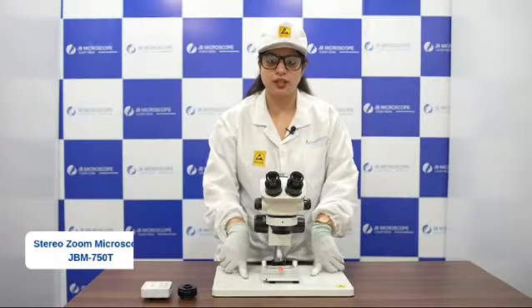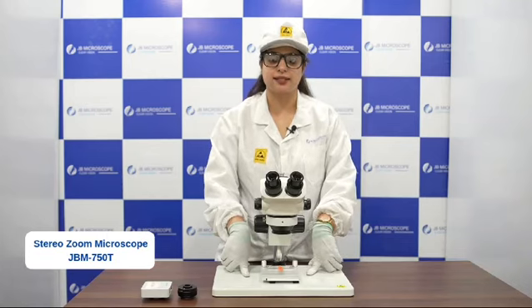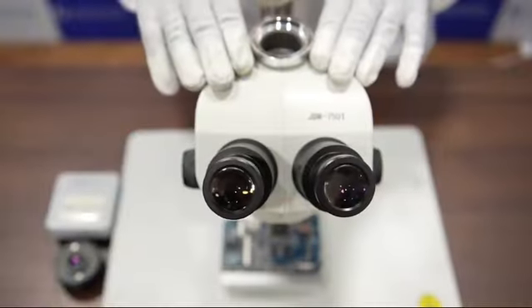This microscope can be used for the food industry in order to analyze the quality of the food. This is the head of the microscope.